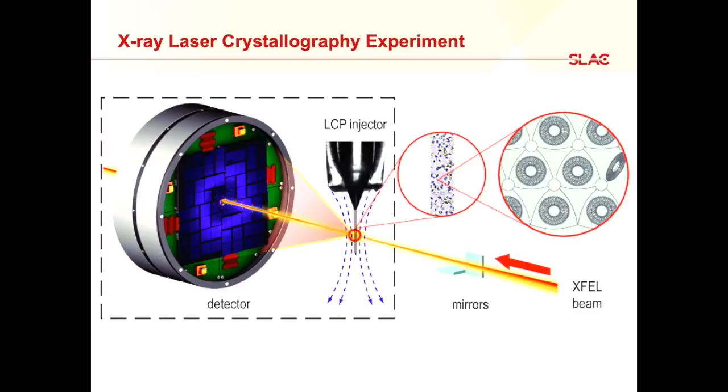And then we measure this diffraction, as I said, measure the angles at which the X-rays are deflected. They all come in on a straight line, and then we measure at which angles those bright spots are, and then deduce the structure from there. So, as I said, conceptually very simple. We take the beam, focus it, hit the sample with it, measure it on an X-ray sensitive camera, not that different fundamentally from your iPhone camera. And do this multiple times to get all the different angles and try to get a structure out of that.